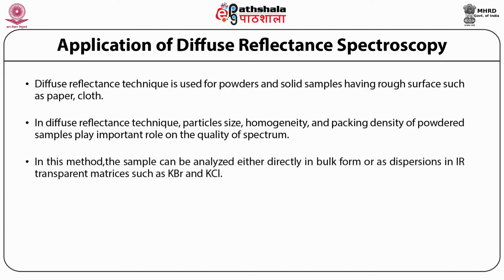In this method, the sample can be analyzed either directly in the bulk form or as dispersions in IR transparent matrices such as KBr and KCl.